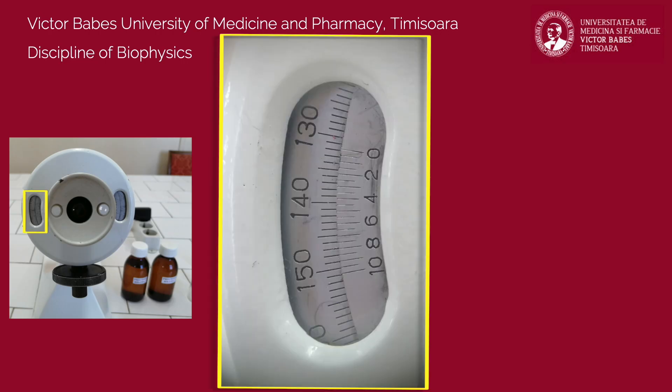See which two values of the external scale are neighboring the zero mark on the internal one. Among the two, pick the lower one, which will represent the integral value of the rotation angle. Then, look for a position at which the divisions on both scales are perfectly aligned. At this position, the value marked on the internal scale will represent the decimal value of the rotation angle.